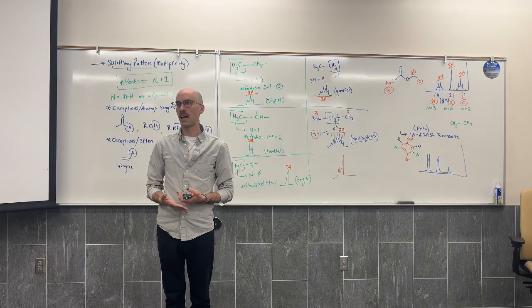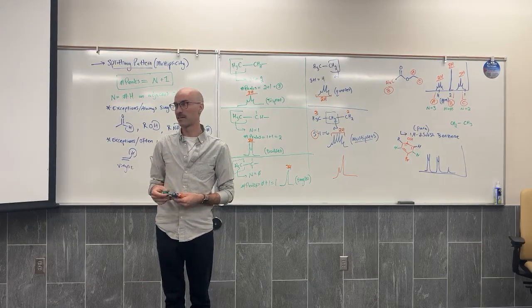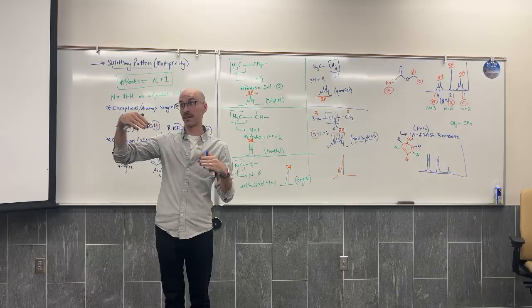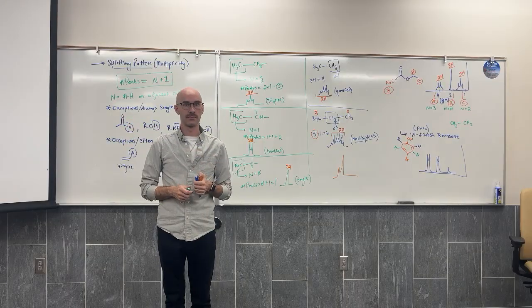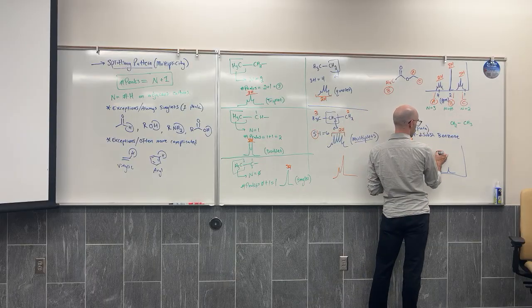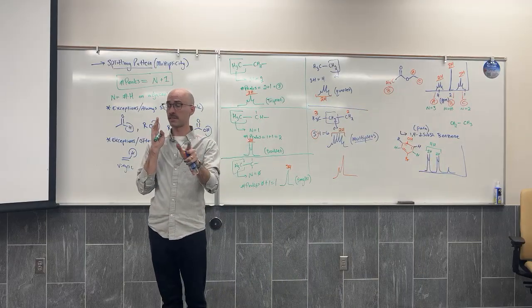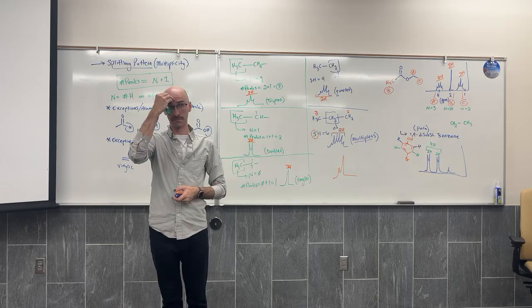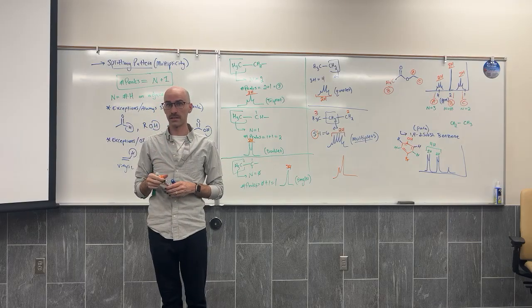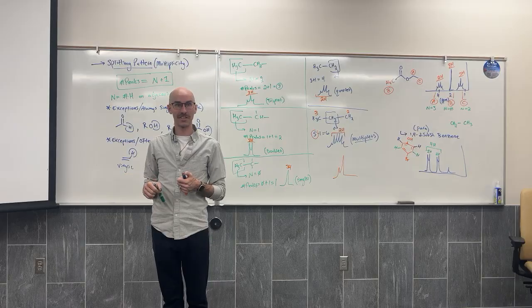That is the only time that an aromatic region is nice and easy to analyze and integrate. Is if it's symmetric di-substituted. So we could integrate this as 2H, 2H, but as you guys saw earlier, we can integrate it as just 4H. And the clean splitting tells us it's di-substituted. What's the integration to the right of that third signal on the right? It's the alcohol's hydrogen, so it's 1H.